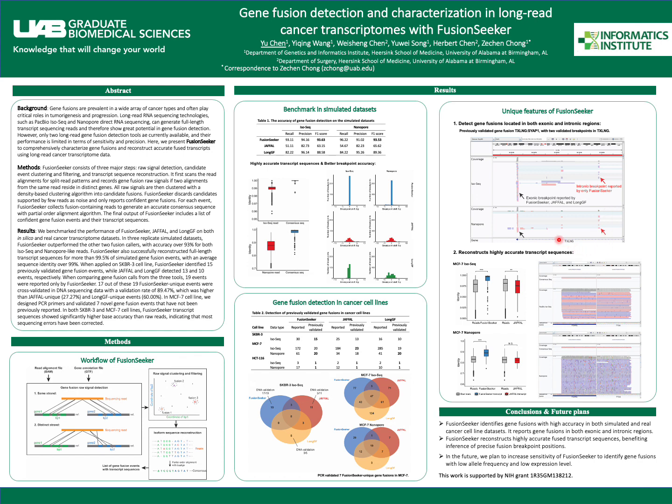And another thing is still about the transcript sequences. Similar to what we did here, we can also compare the identity between FusionSeeker's sequence and the sequence from the raw reads, and we do see a higher accuracy in the transcript sequence reported by FusionSeeker. And the accuracy is similar or lower in the JAFFAL result here and here. And on the right side, we have 2 examples showing the read alignment and also the transcript sequence alignment. We see a lot of sequencing errors in the raw reads, but we cannot see any here on the top in FusionSeeker's result.